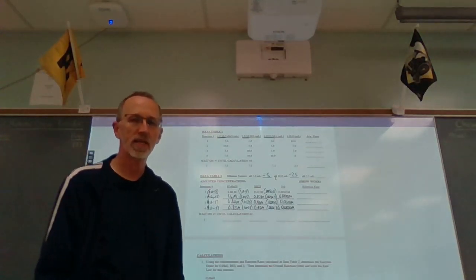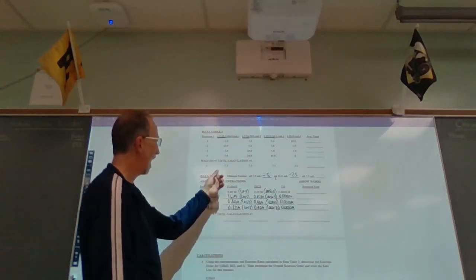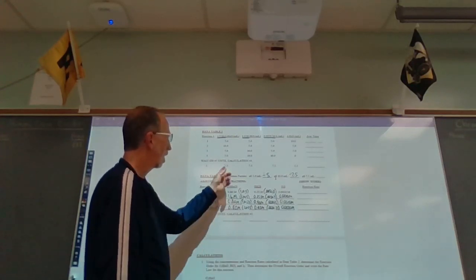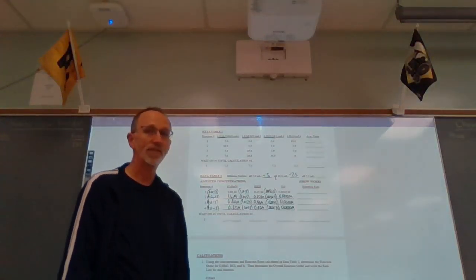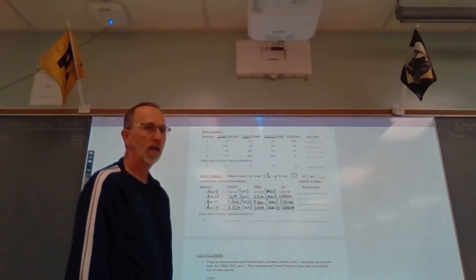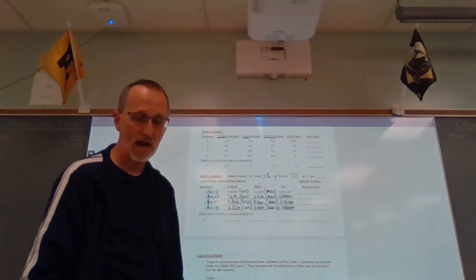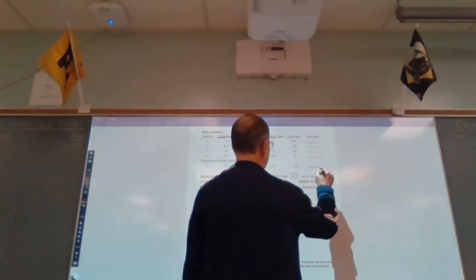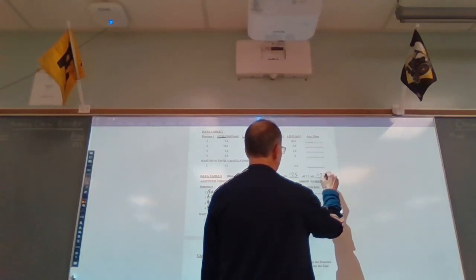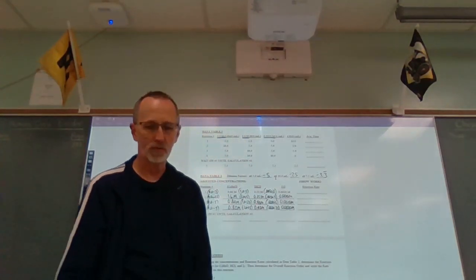Water is just the substance that brings the volumes equal for all the solutions, which is necessary to do. The last one, number 5, we have 7.5 mLs originally of actually all 3 of these. And if you take 25 divided by 7.5, you get 3.3 repeating. So our dilution factor for all the 7.5 mL ones is 3.3 repeating.